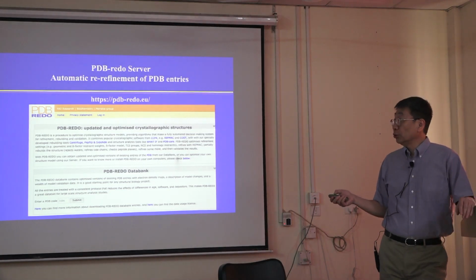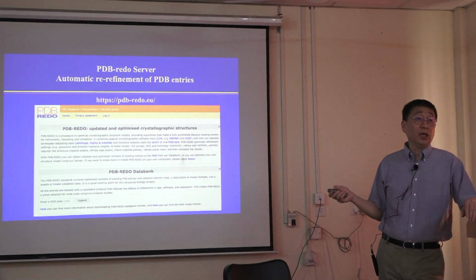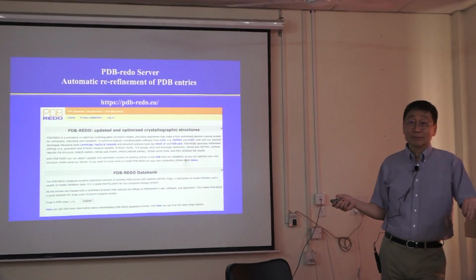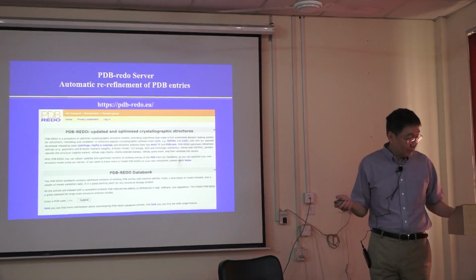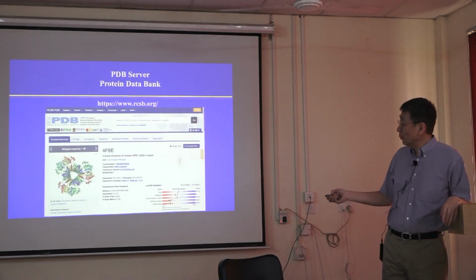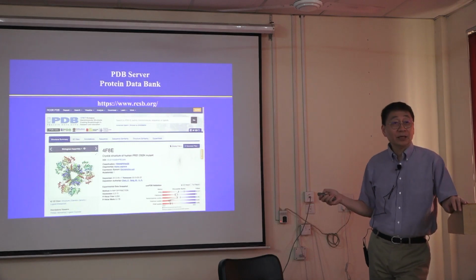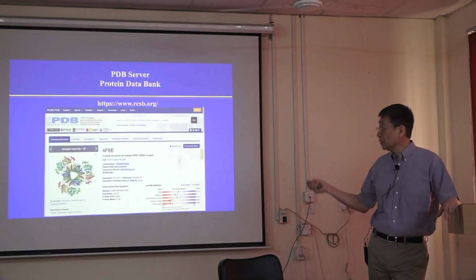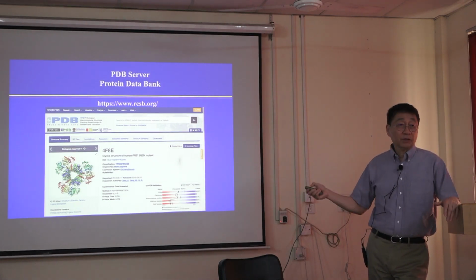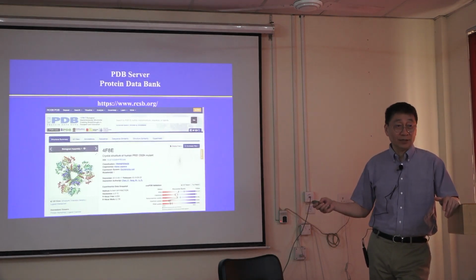And what you may not have heard of is a server called PDB Redo. As I mentioned, our structure from 2006 will be all the way over here. So what PDB Redo did is it took the deposited structure factors and the model, and automatically re-refined the structure using modern technology.